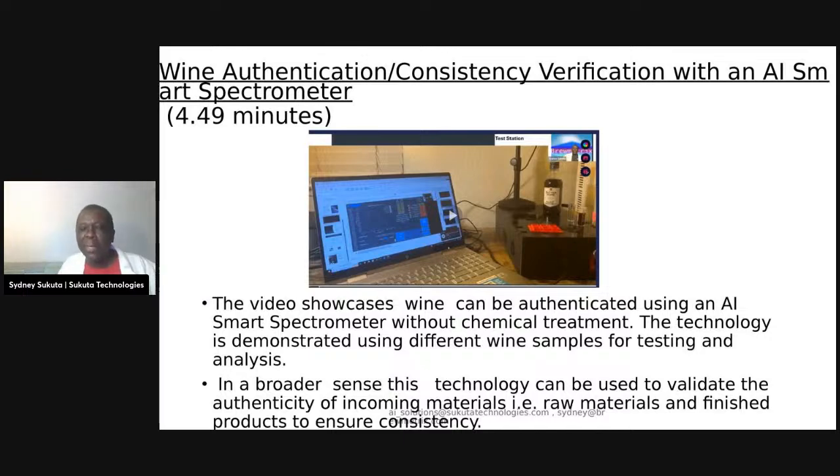I know this is a beer forum, but it's close enough, I thought. So it's Sutter Home Wines. We went through the process, and then we ran, let's say, the Merlot or Chardonnay. The machine will say yes or no, and then I'll try other brands. The machine will reject it: no, it's not that kind of thing.